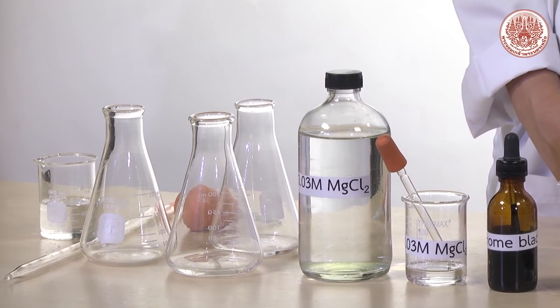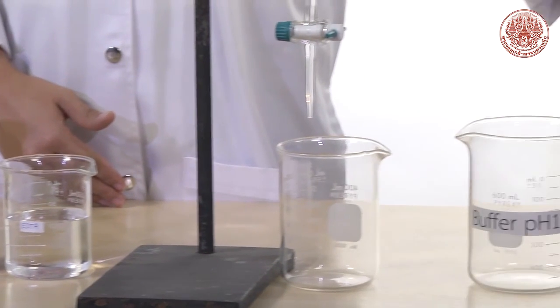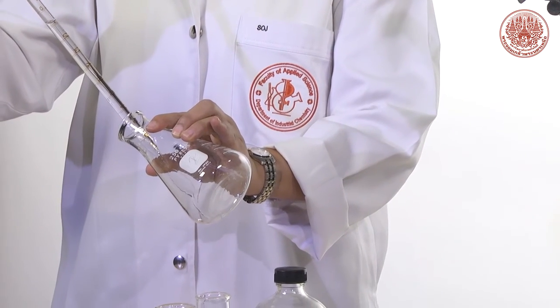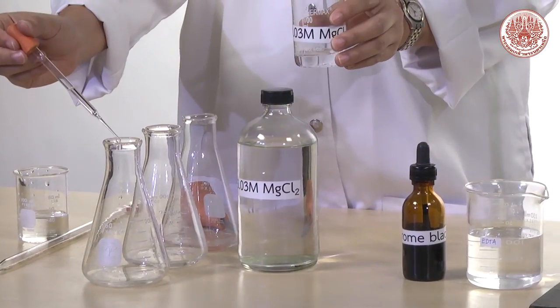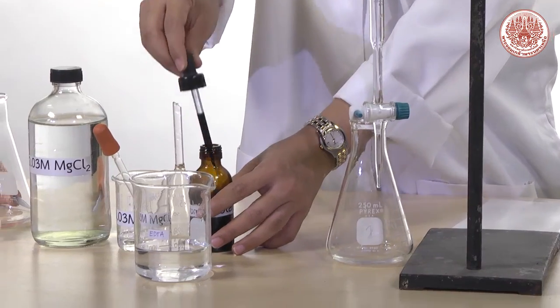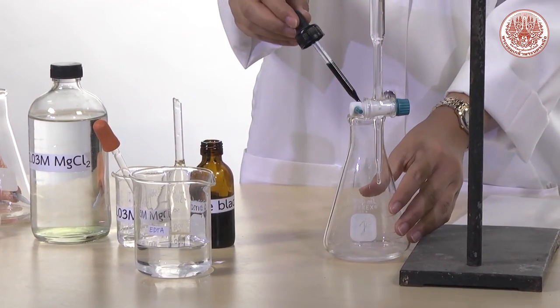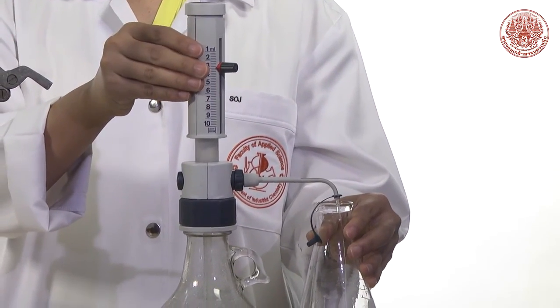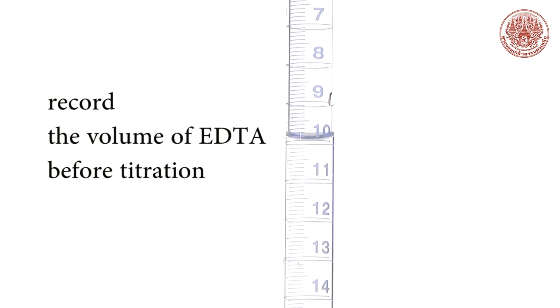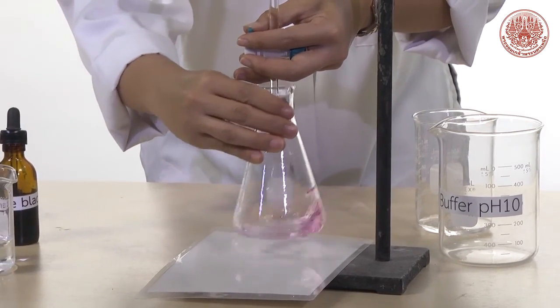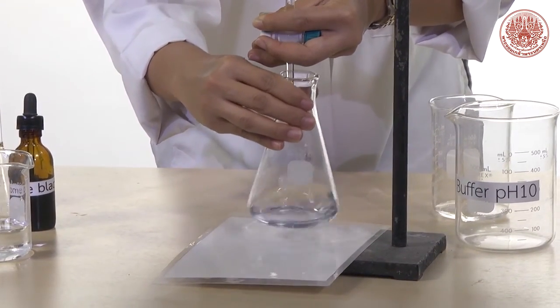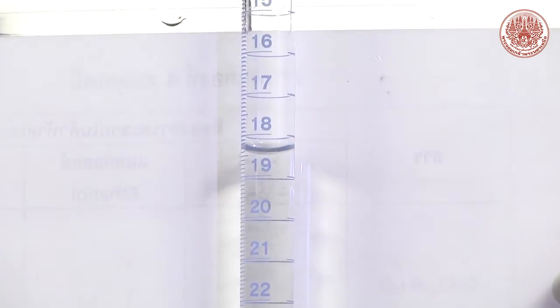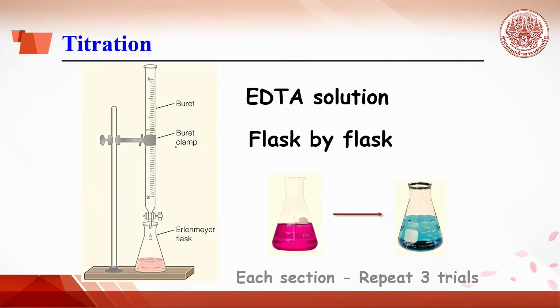Section 1 — blank titration. Pipette 10 ml of distilled water and transfer it into an Erlenmeyer flask. Then add 8 drops of magnesium chloride and 1 drop of indicator. A wine-red solution will be observed. When ready to titrate, add 3 ml of buffer into the flask. Titrate until the endpoint, where the wine-red solution turns to sky-blue. Record the volume of EDTA as blank. Repeat titration for the second and third flask.